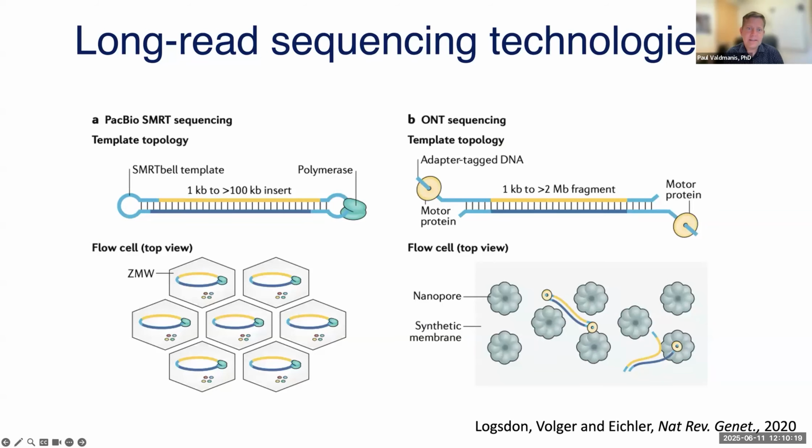There have been a lot of advances in long-read sequencing approaches to circumvent some of these limitations and identify the exact length and internal sequence of some of these repeats. Two that we use in the lab include PacBio single molecule real-time sequencing, which adds SMRTbell adapters after digestion of DNA and reads sequences over and over again, and with enough passes, it can resolve the actual sequence of these larger segments, kilobases in length, with fairly high accuracy, approaching the accuracy of Illumina short read sequencing. And then other technologies, including Oxford Nanopore sequencing, use pore-based approaches to identify the actual sequence of a long DNA molecule that can be megabases in length, which can help piece together larger structural variation within the genome.